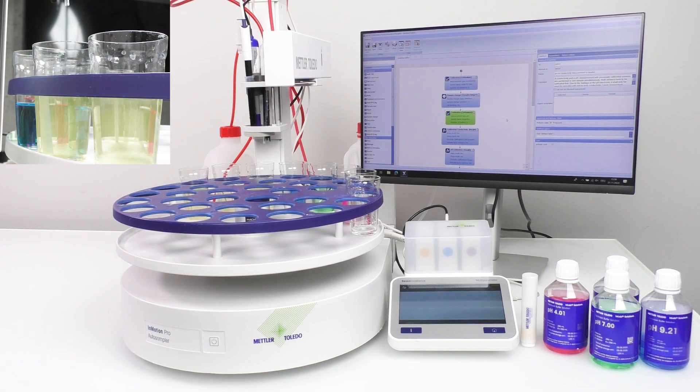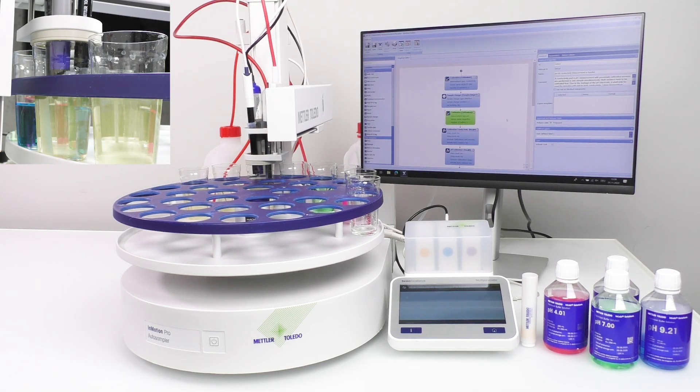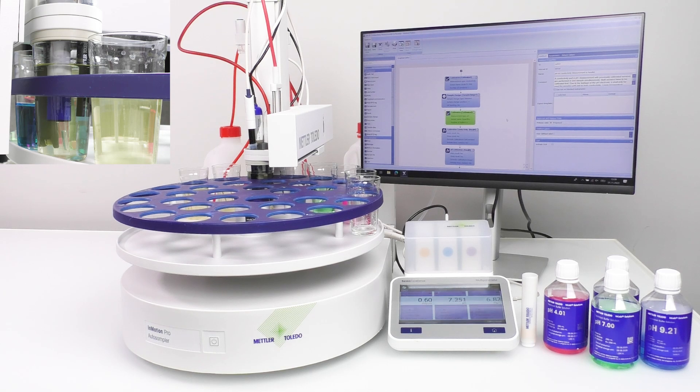Once the sensors are calibrated and ready, immerse them in the sample, and the three parameter readings will appear on the meter screen. You can record and keep track of your readings effortlessly.